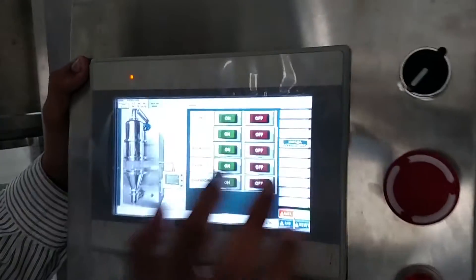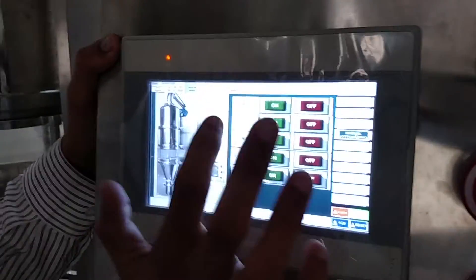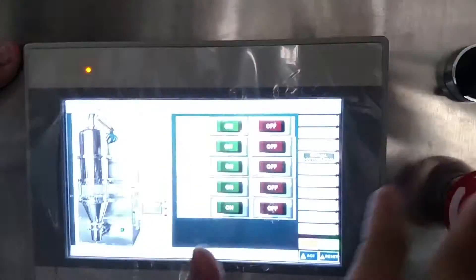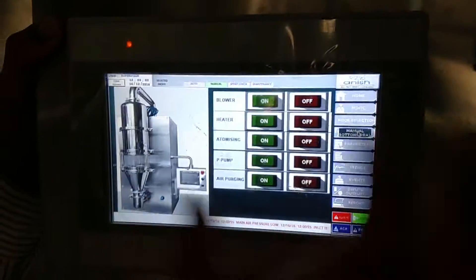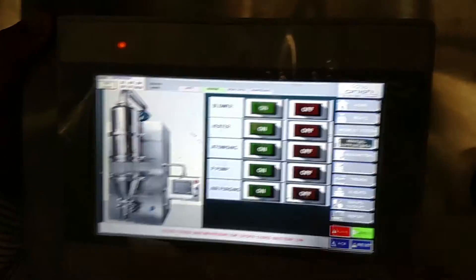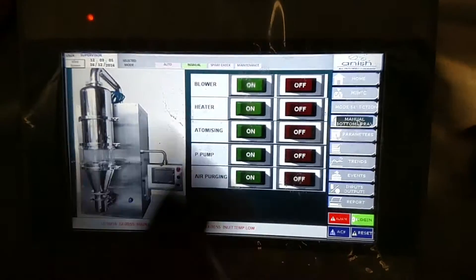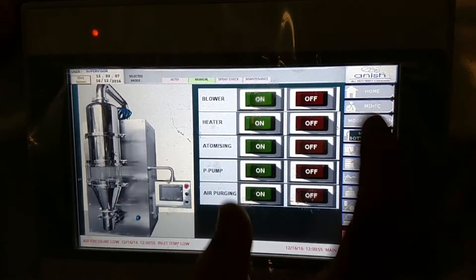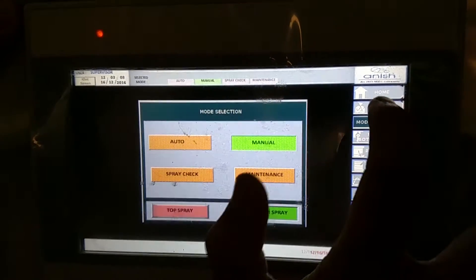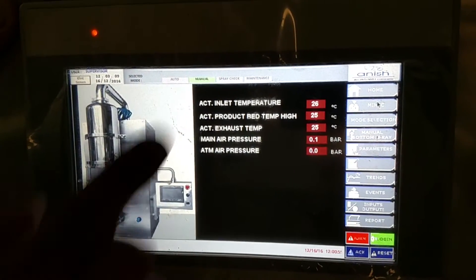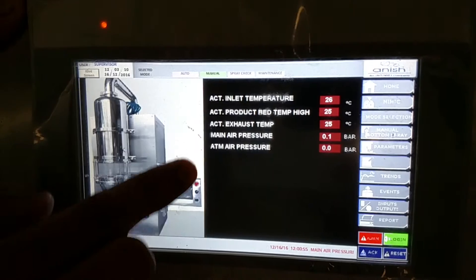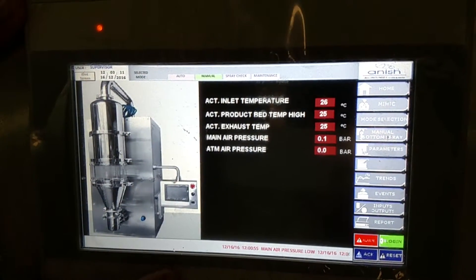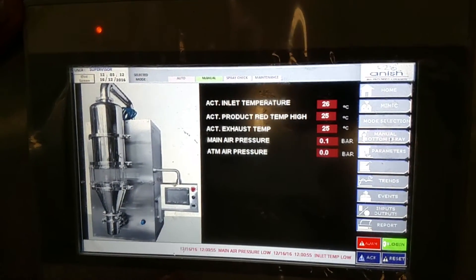We have to go to manual mode. Then we have to turn on the compressor. Once we have started the compressor, the air will start being compressed. And then in mode selection, we go to mimic. We will see all the conditions that are now actual.